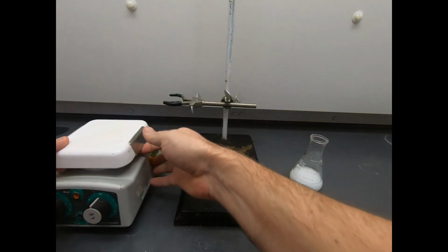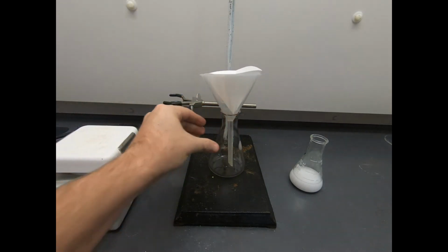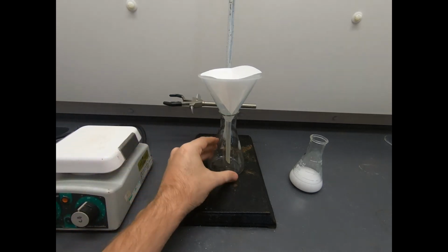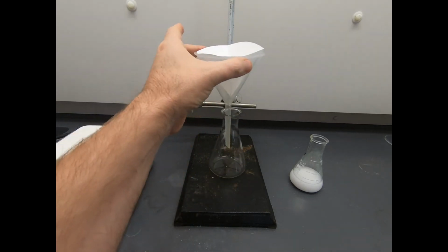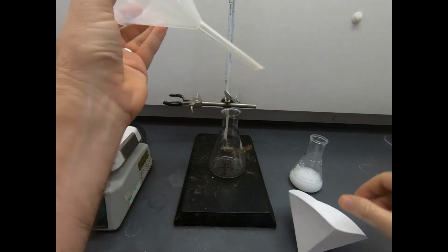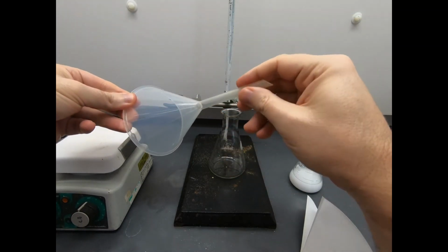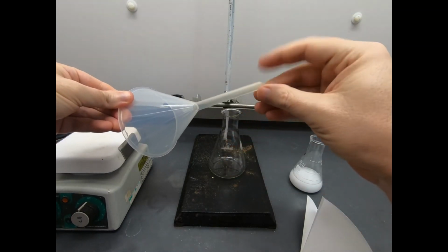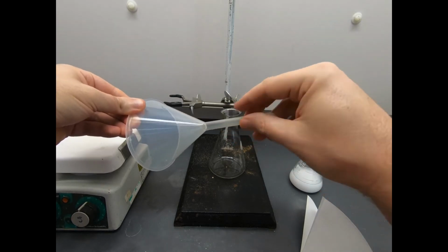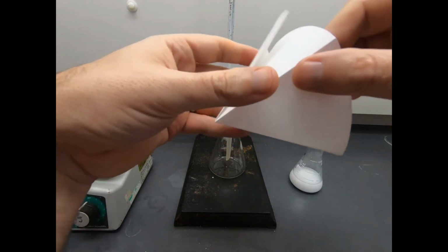And now we're going to filter these solids. And we expect to see solids because that's the residue left from these tablets. So we're going to filter this into an Erlenmeyer flask. We're going to use a filter paper that's been folded to fit into the funnel. And for this funnel, note that we have a long, narrow stem. This is a liquid funnel with the long stem. And we can do this filtration.